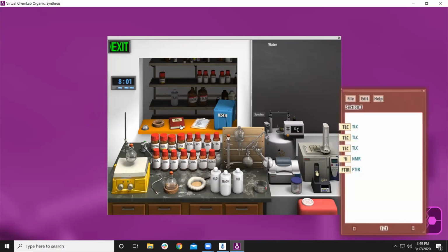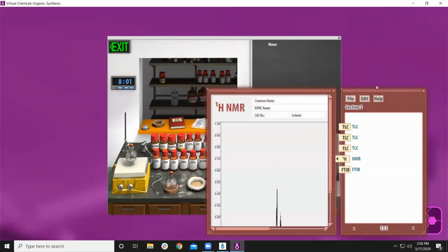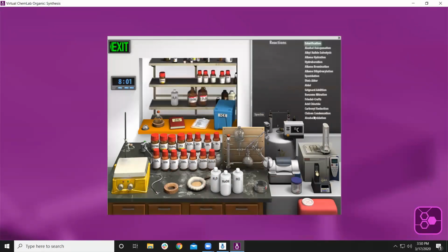And we've got about, I don't remember exactly, 750, 800 different spectra. And then here's where they're all saved in the lab book. And so lots of things you could do here, all of these different reactions. So we have, I think, about 5 million different permutations of what you can do. Many of them don't work, don't give you any reaction, but we let them go do that.